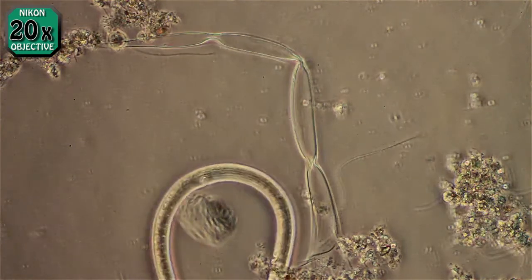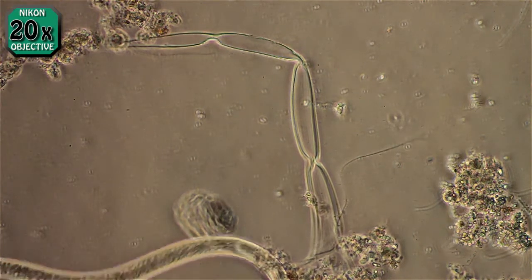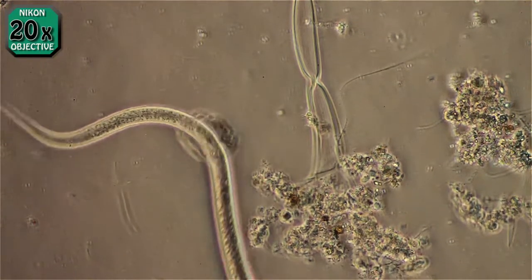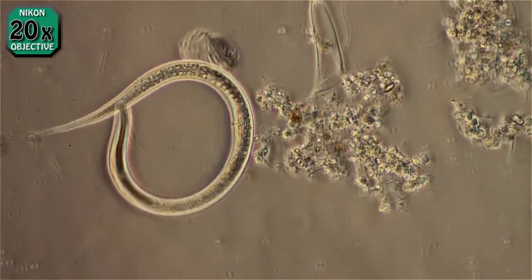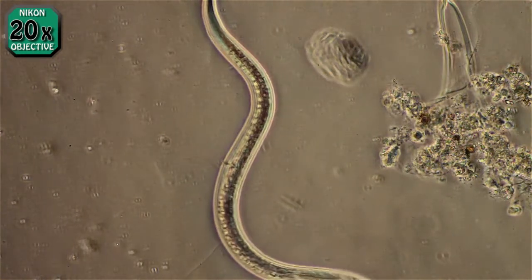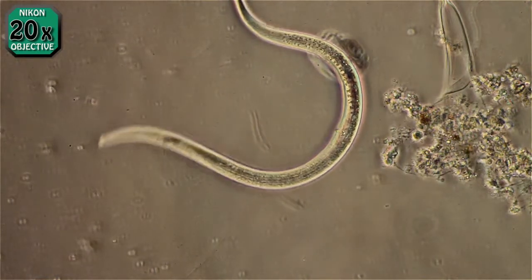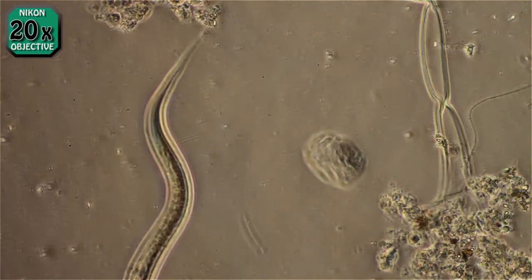I have actually caught one in the act of shedding before. It seems to take a long time, although I never did watch it from start to finish. It looked like it takes a long time — the slide lasted 15 or 20 minutes or more, and he was still working at it when I left.